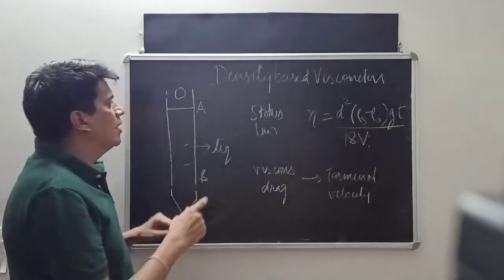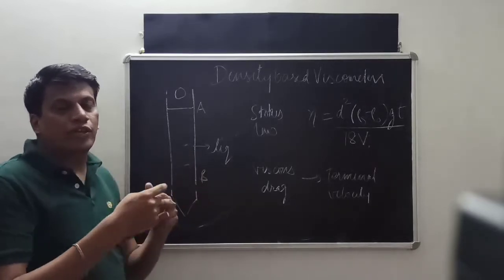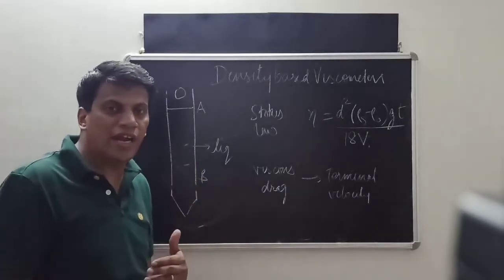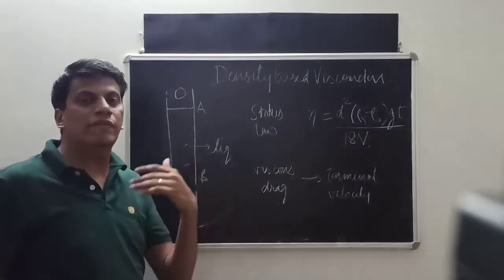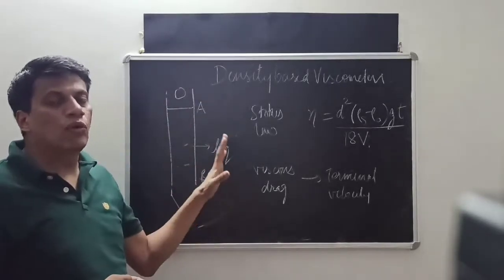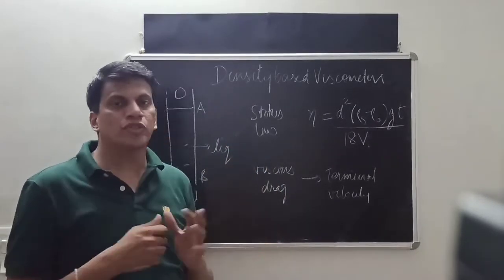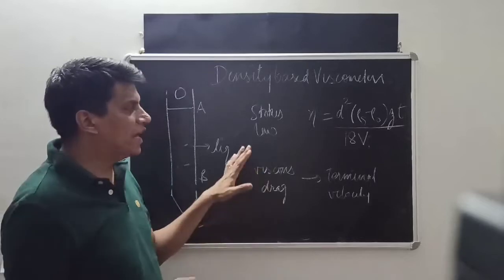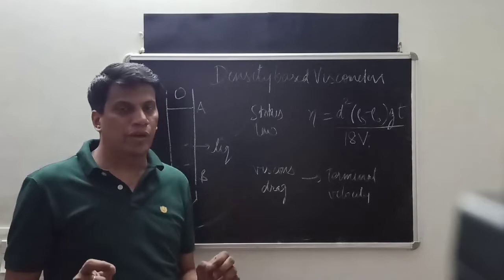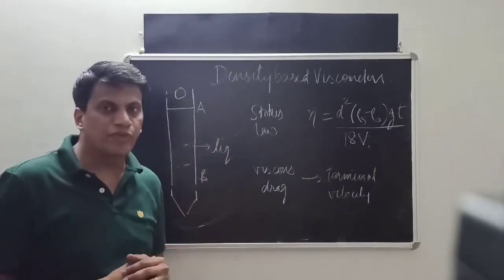We determine the time. Then we change the liquid to the test liquid, so we use both standard and test liquids. First we do the experiment with the standard liquid, then with the test liquid. Similar to capillary based viscometers, they only give us information about relative viscosity. No absolute viscosity determinations can be made. They can be used for viscous materials like glycerine, but only Newtonian materials. Non-Newtonian materials are not tested via density based viscometers.